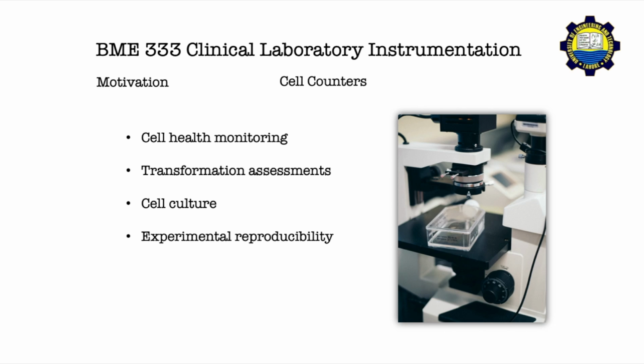choosing the cell concentration in such a way that you want your experiments to be reproducible. And hemocytometers allow us to ensure that the cell concentration that we take of a sample is measurable. And when it's measurable, we're able to reproduce those experiments or standardize them for certain applications. So in terms of experimental reproducibility, hemocytometers play a very key role to standardize or ensure that similar concentrations or same concentrations are kept for same kind of experiments.